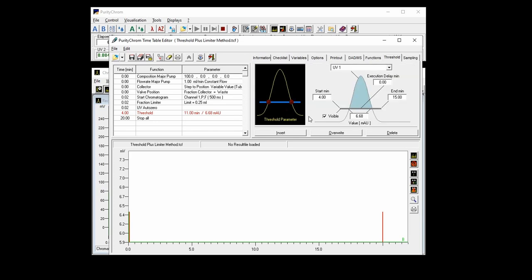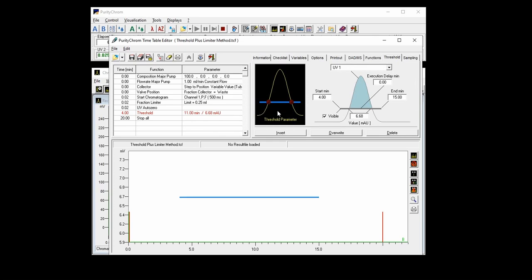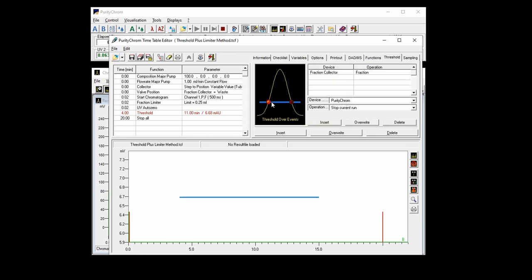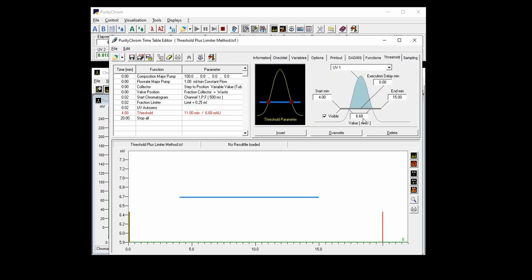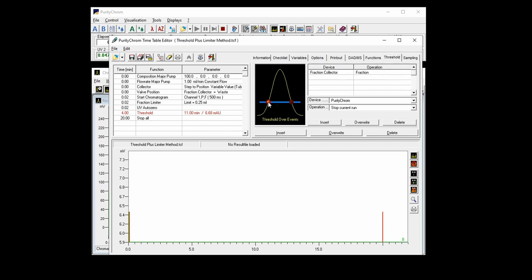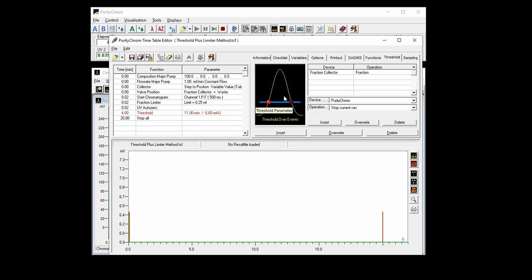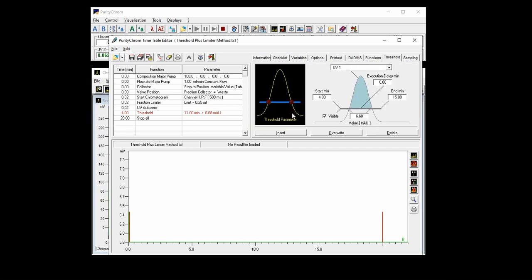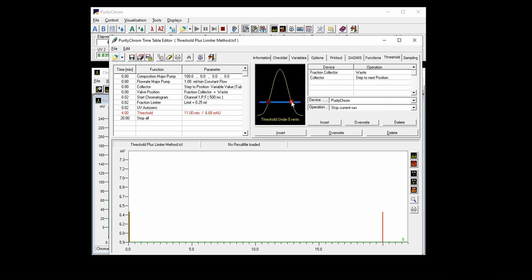You can also use two different thresholds for starting and ending a fractionation. This you would do by inserting two fractions and in one threshold, probably with a lower UV signal intensity, you would just define what's happening when the threshold over event is occurring. And in the second threshold you would then just define what should happen when the signal falls below this threshold.